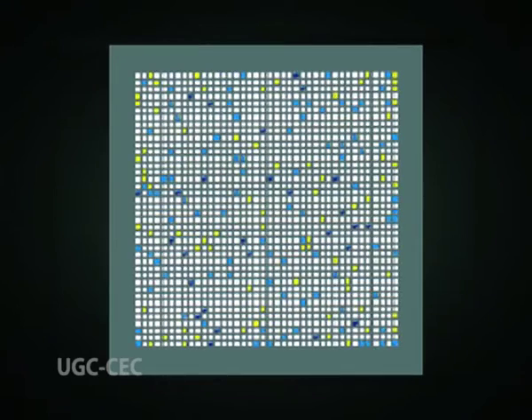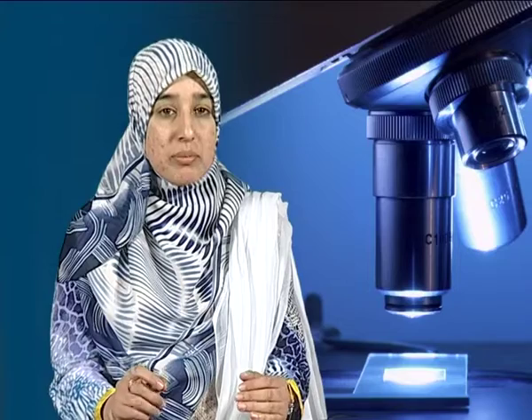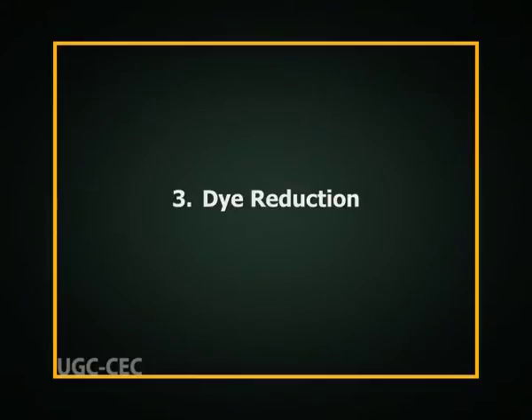A modern variation on the MPN theme is the use of the hydrophobic grid membrane filter. A sample is filtered through the HGMF, which is divided by a hydrophobic grid into a number of small cells or growth compartments. After incubation of the filter on an appropriate medium, each of these cells is scored for growth or no growth.